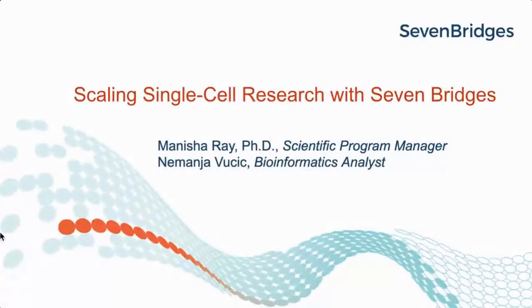My name is Manisha. I'm a program manager at Seven Bridges. I work with the Cancer Genomics Cloud, and I'm very excited to tell you today about some tools that we've developed to make it easier for single-cell researchers to do their data analysis on the Seven Bridges platforms.